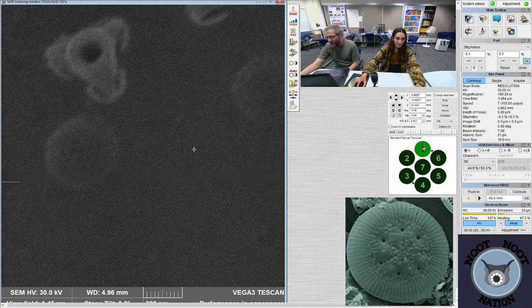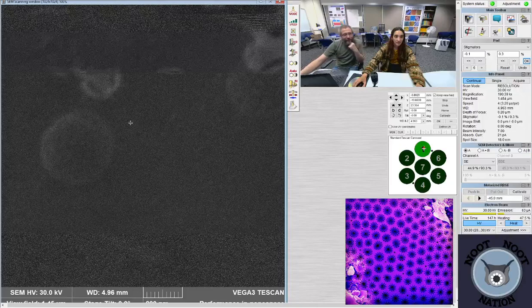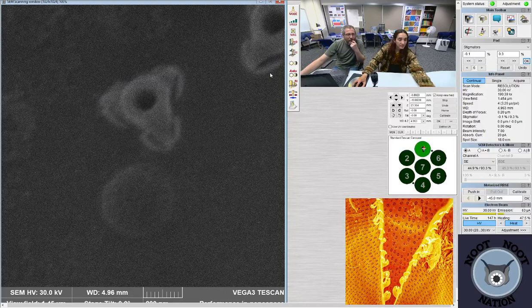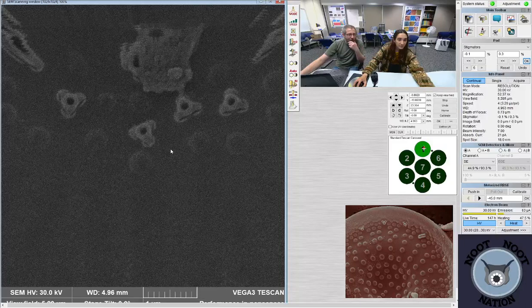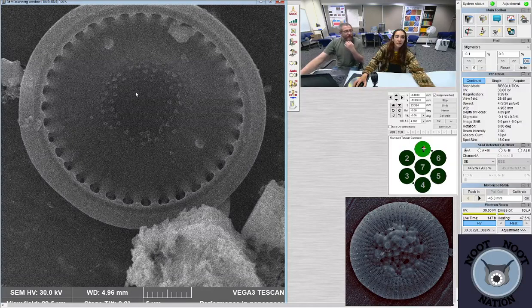Sorry, I'm trying to work out the technical details a little bit here with Laura. So she's learning to do this stuff. And I think she's done a nice job getting the stigmation on this one pretty good. And then at this point, I think maybe just zooming out. Yeah, there. See, it looks really sharp. It's just a matter of, like, you're really close in, so it's going to be looking a little fuzzy. Yeah, now see how sharp it is? It's way better.